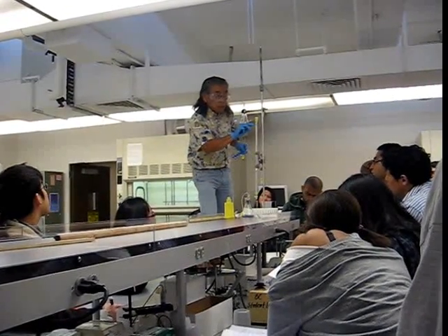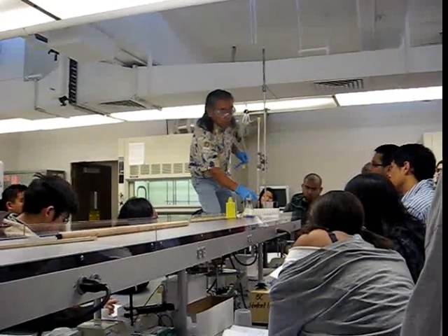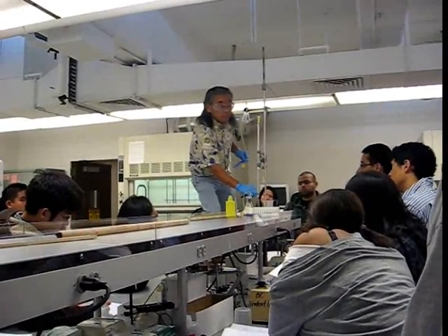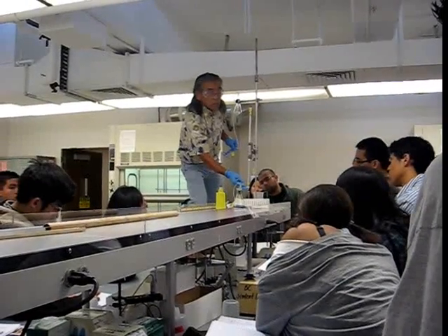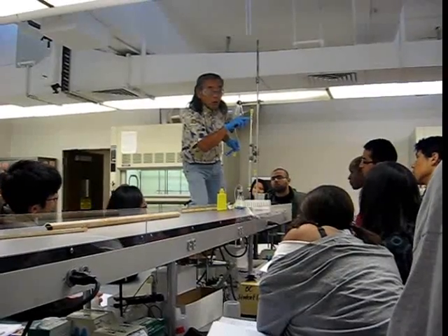So here again, you add your sample and open this up. This does not get opened until you've added your sample.